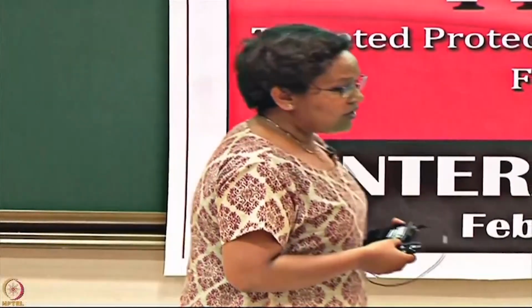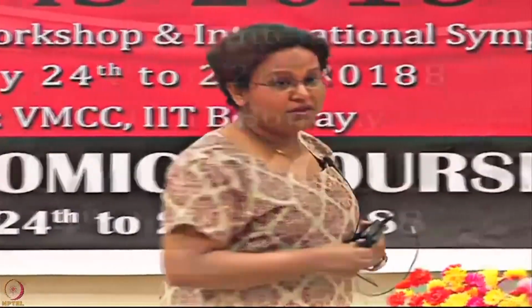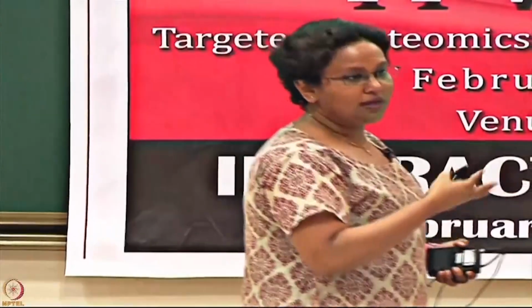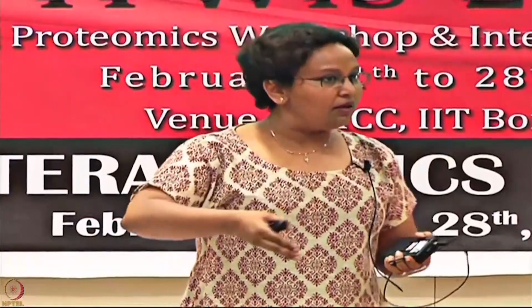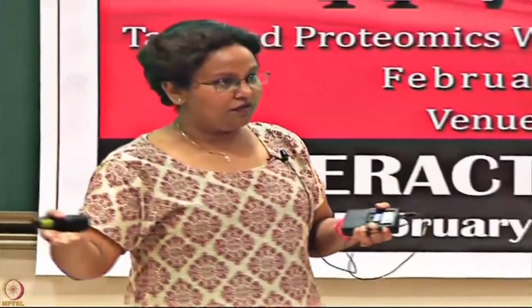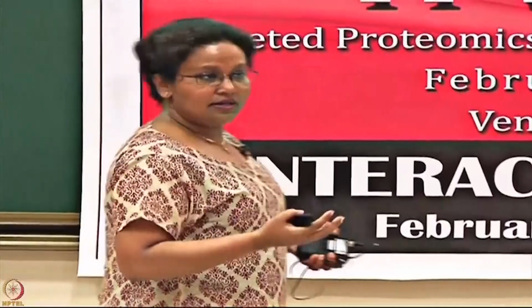Okay. There are 3 different ways to produce or make your reference surface. The first one is unmodified, you do not have to do anything. In most cases that works, but if you are not happy with that, you can also treat it exactly how you immobilize. So, you activate and deactivate without passing the ligand. So, you are treating the surface exactly the same way that you have treated your active surface. So, the first one is unmodified, the other one is activated and deactivated.